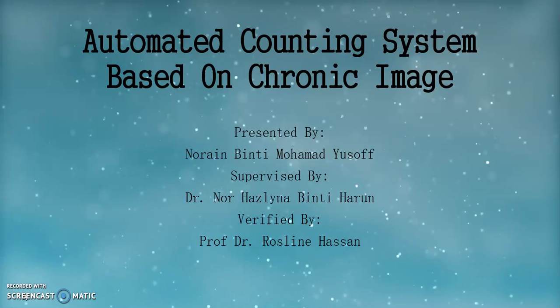My system name is Automated Counting System based on chronic image. But first, let me introduce a little bit about the background of this project.